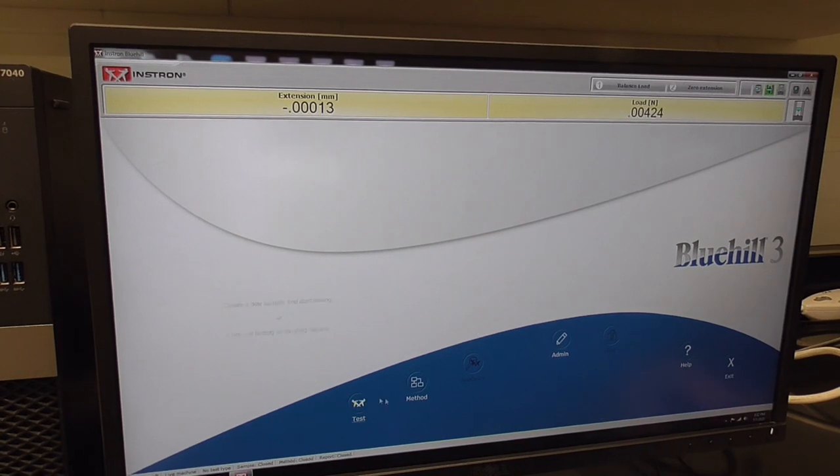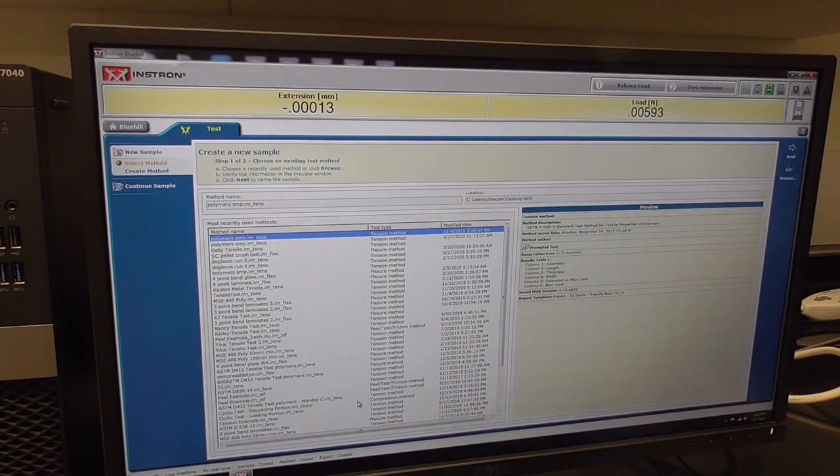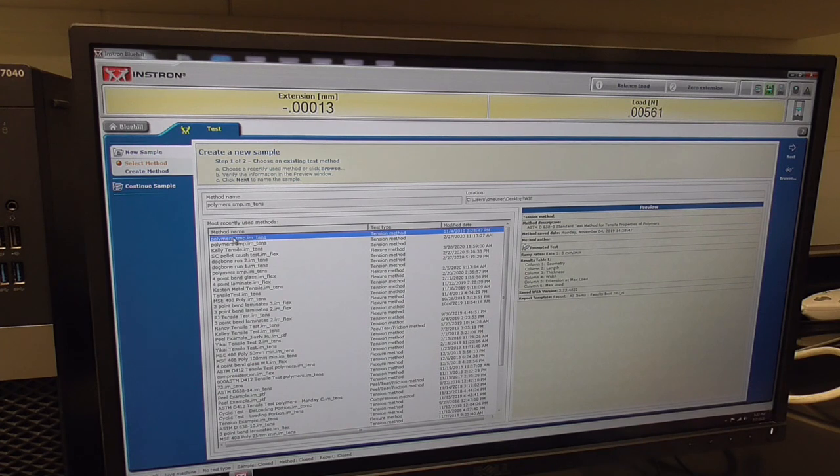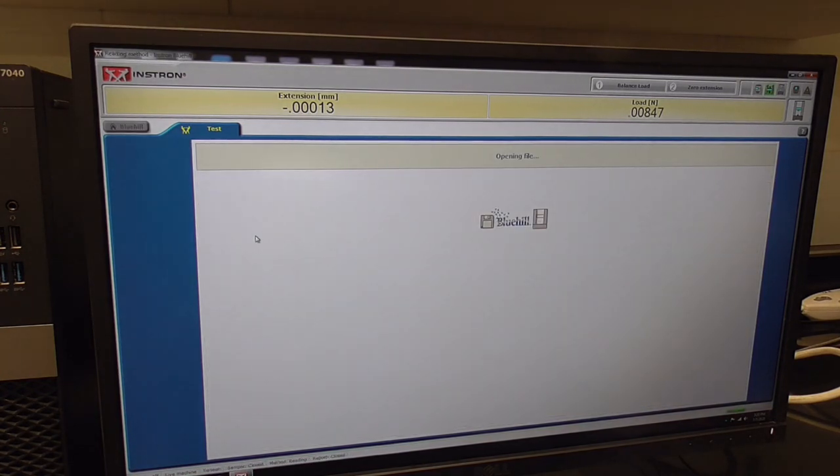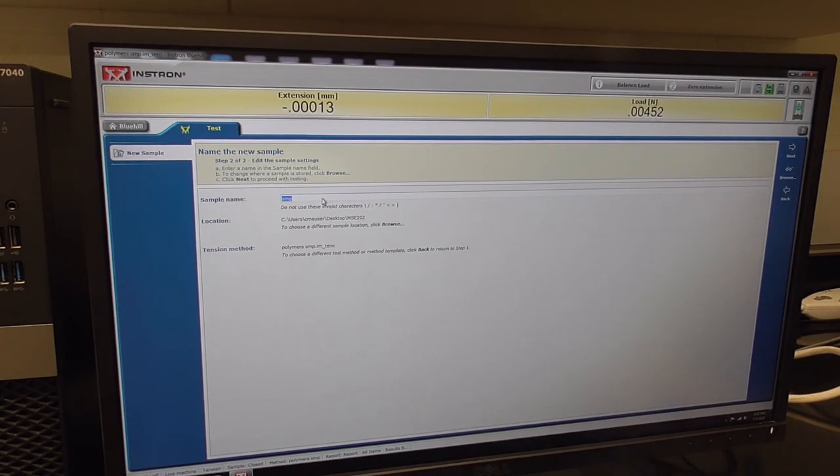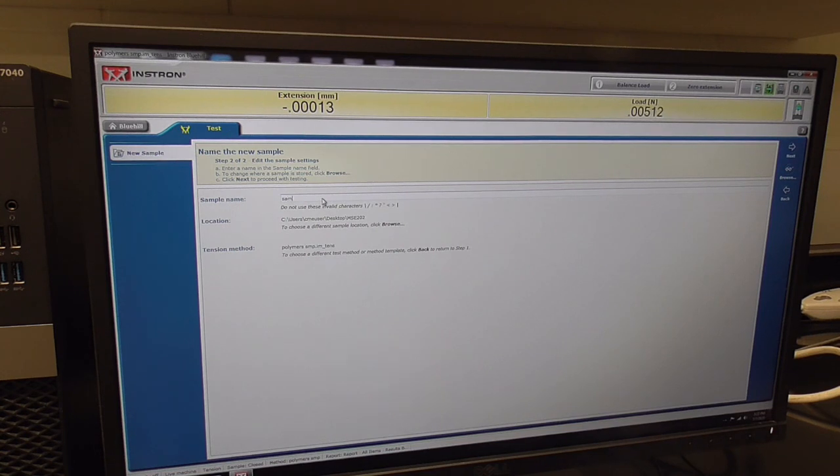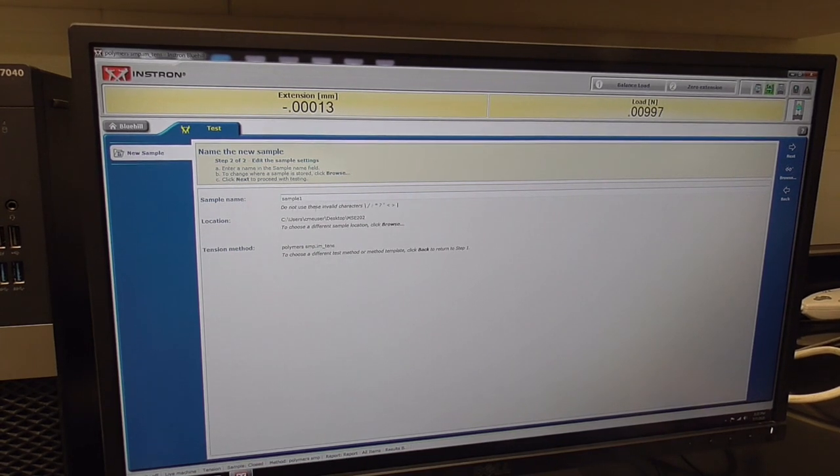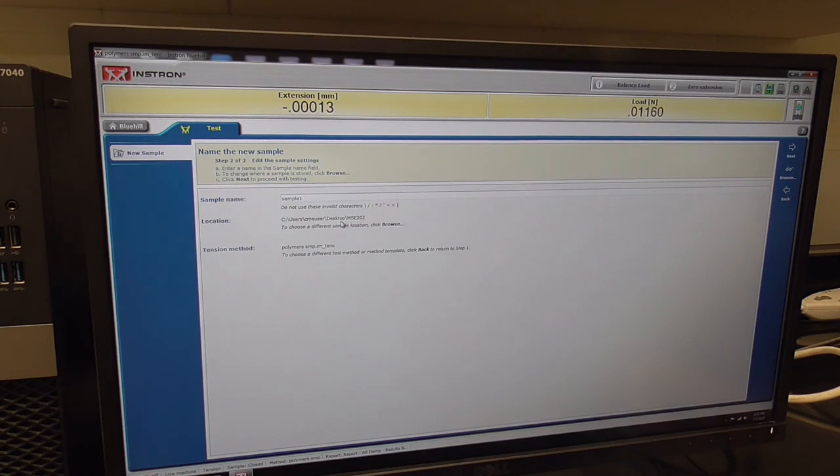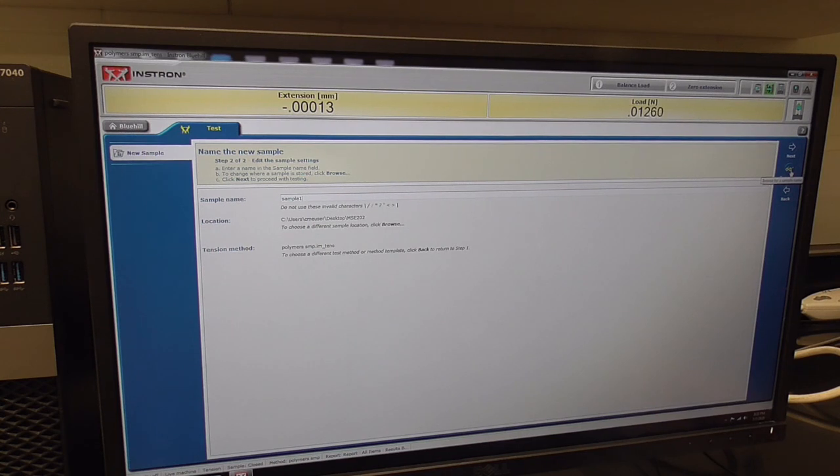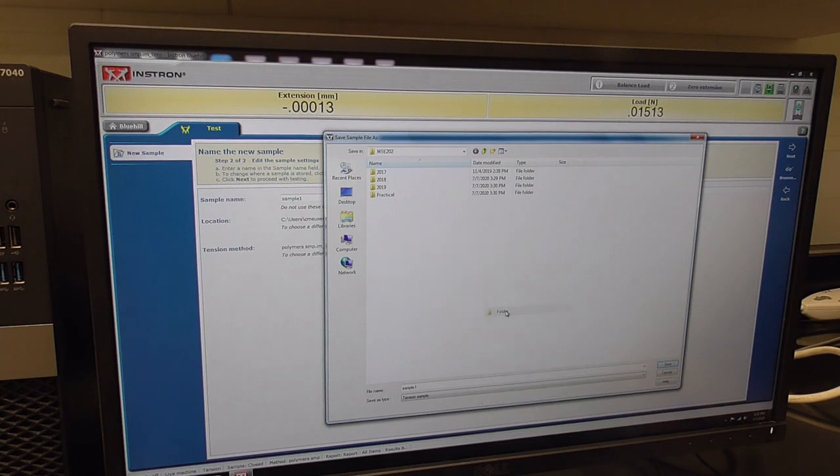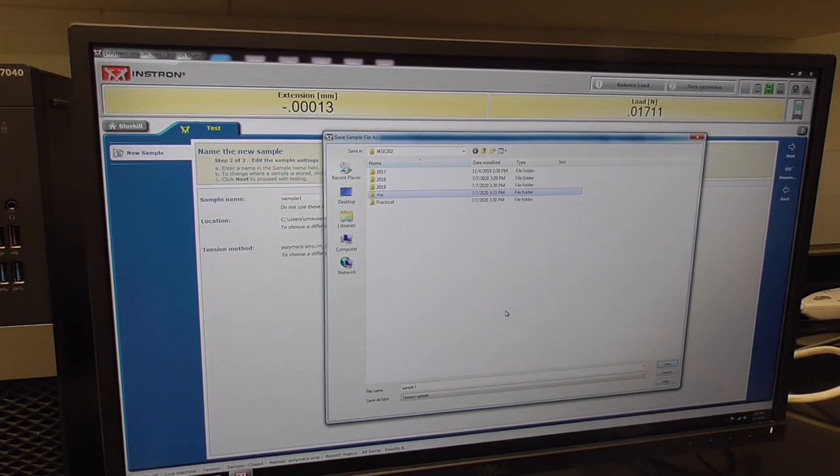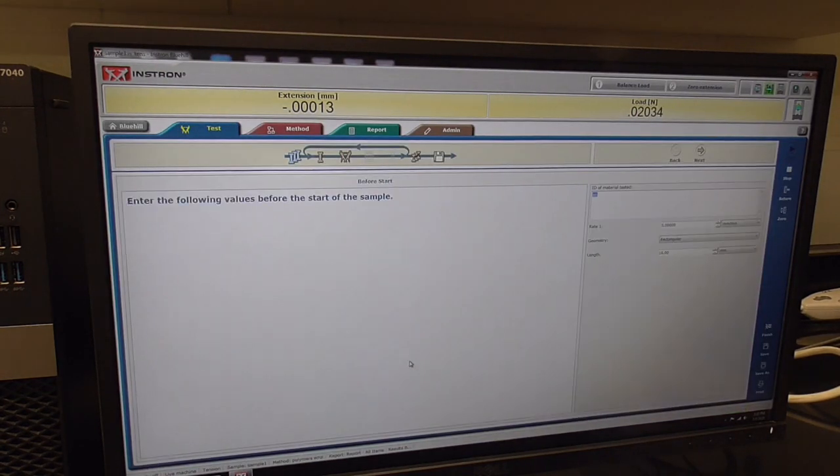For the most part, methods for your courses are already created and you can go directly into the test. The first screen that pops up wants you to choose your method. We're using the polymer tensile test for this training. That method is going to open up, and the first thing I want to put in is the name of my sample. It has an example there, but you can name it whatever is characteristic of your sample. This is the folder it's going to put it into: MSE202. That's a good place. If you wanted to create another folder, you can browse over here on the right toolbar and make your own folder.